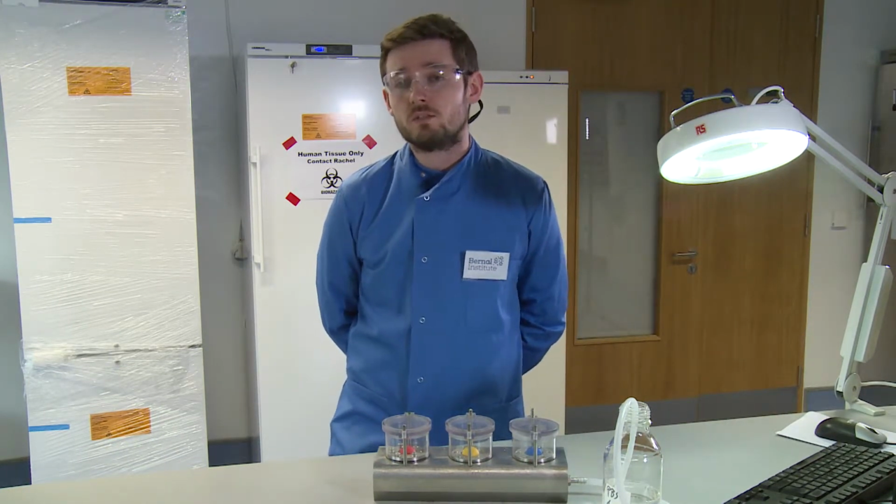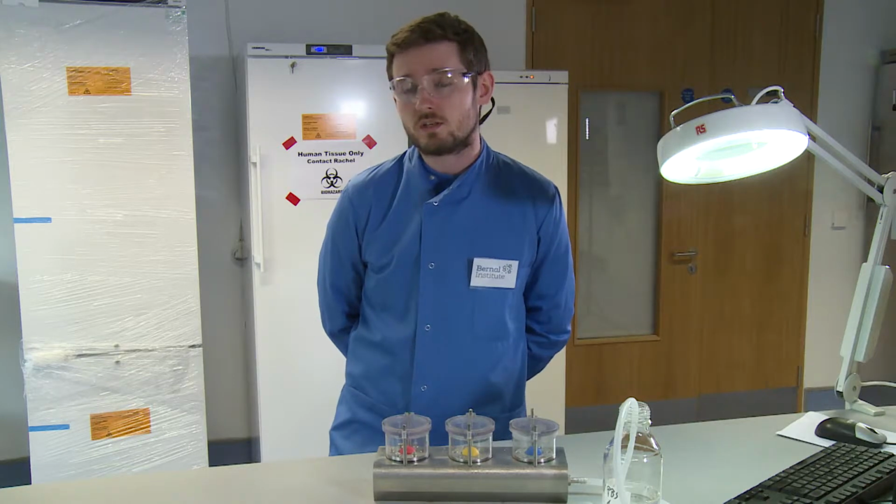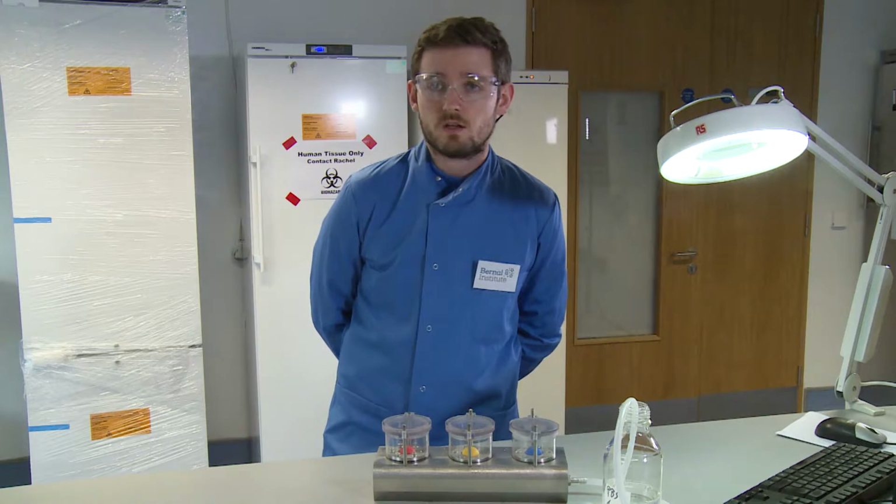We can create a multi-layered hydrogel that looks at the different mechanical properties of the different areas in the intestine and seed the corresponding cells. We can look at how these forces then change and alter these cell types, going from quiescent to a reactive state.